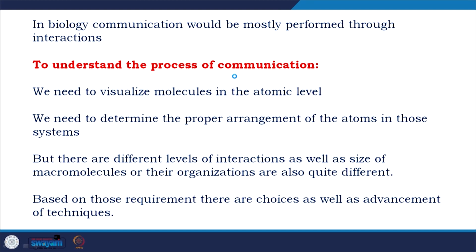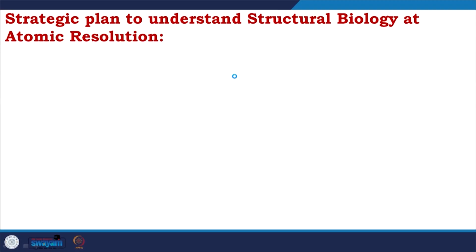I will talk about cryo-electron microscopy. Cryo-electron microscopy, when it started, was actually at much lower resolution, but today if you look at this, it is a sensation. This is getting into atomic resolution. We will talk about that later.